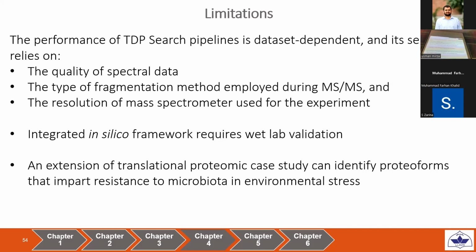But if we have a higher stringency on our tools, this will give them more confidence. FDR is blind, right? It wouldn't care if it's a correct identification or not. As soon as the two distributions overlap, it's going to put a cut. So this makes our tool a little bit more reliable. Yeah, so they have it at 5%. Can you use this pipeline for bottom-up proteomics data?